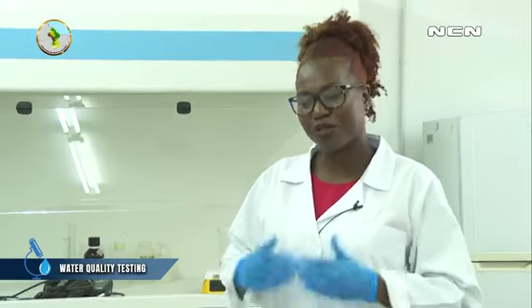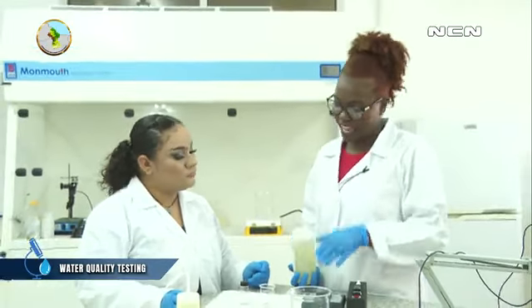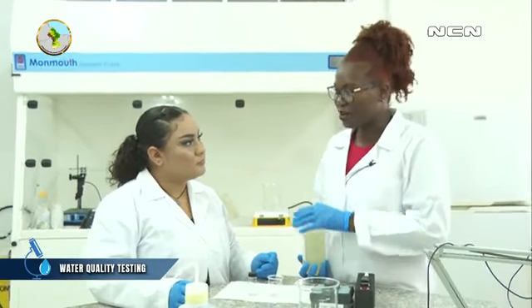I'm Joanna Hope, a hydrochemist at the Water Quality Lab of the Hydromet service. So now we have our sample. It's here in the lab, so we'll be doing two tests. We'll be testing it for pH and for turbidity. So what we're going to be doing now is testing our water for turbidity and for the pH.